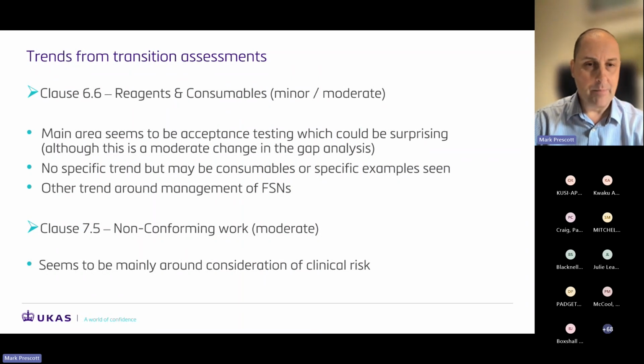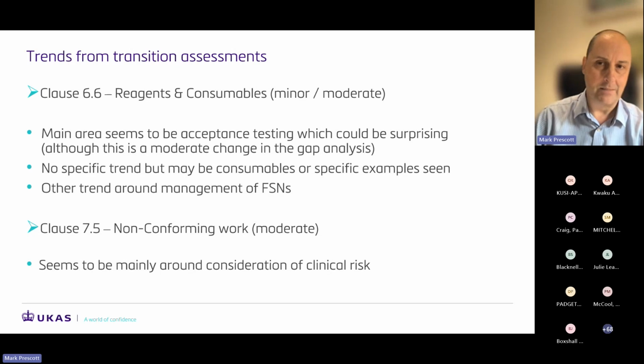The findings seem to be mainly around the consideration of clinical risk. We're seeing lots of comments that there's no risk to patients from a particular incident, but actually there's no justification for that. So I think going forward, it may need a little bit more detail. Rather than just assuming there's no clinical risk there and there's been no risk on patient management, actually having a good look at that to see whether there's some more detail that could be added.